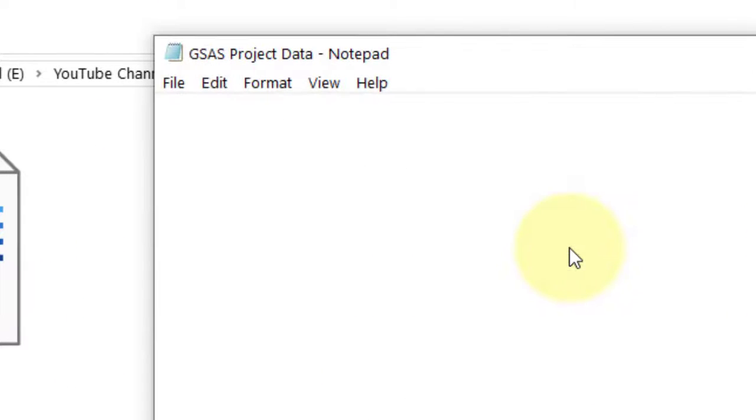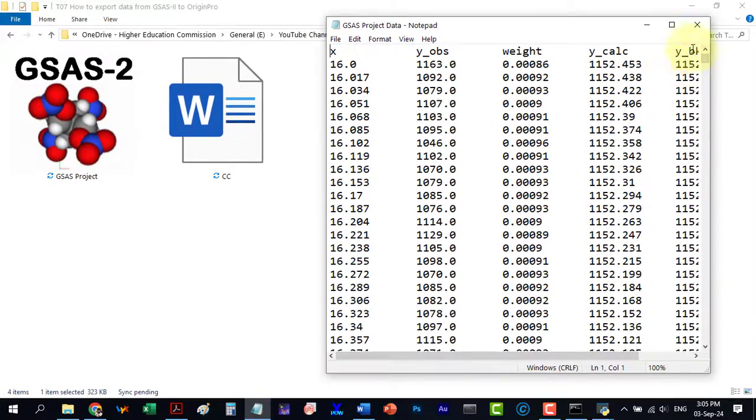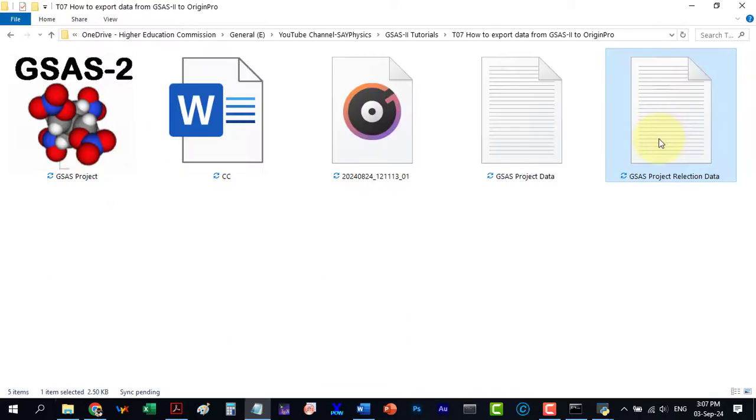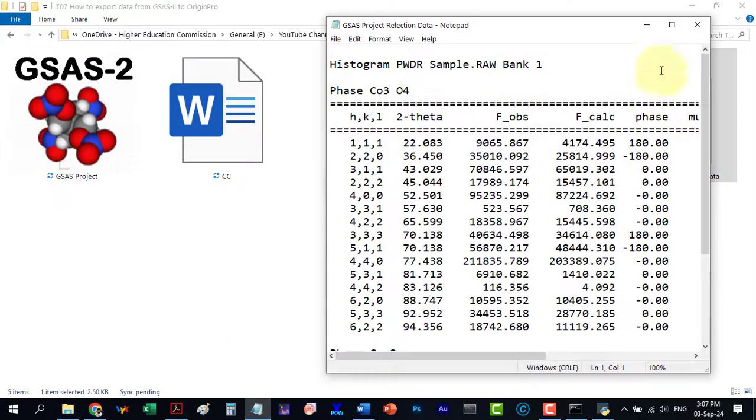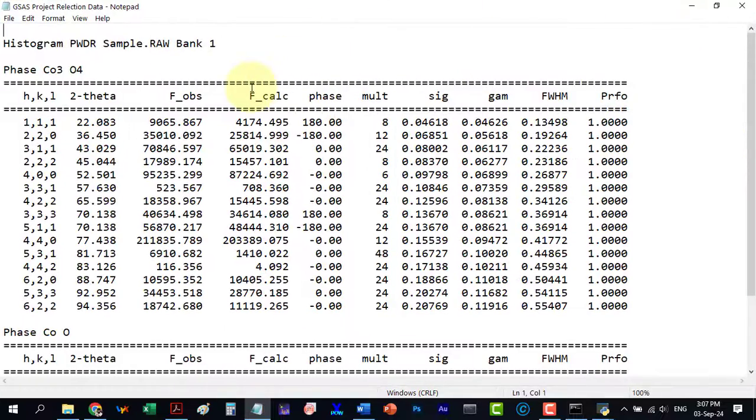Let's open this data file. As you can see it contains all the necessary columns while the reflection list file shows all the reflections.